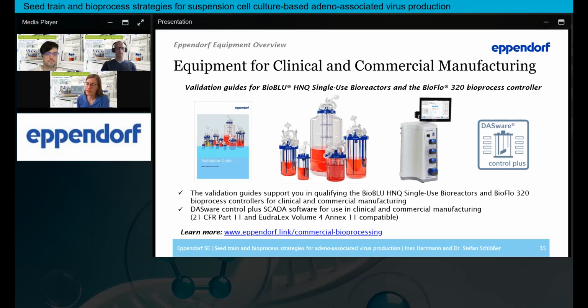We usually look at the protocols and also what the flask suppliers recommend, because there are many different types of flasks, so it depends a little on which flask you work with. It's also good to try out different fill volumes, maybe in the beginning when you set up your culture, but in general 20% up to 40% is a good rule of thumb for mammalian culture.